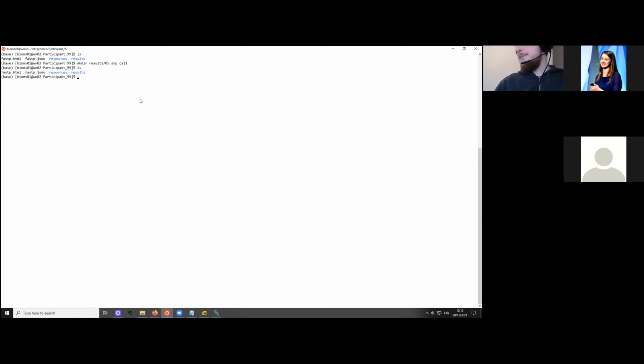Basically we want to find locations in our sample data which have different bases from the reference genome. In this specific case, we will only be looking for polymorphisms or base substitutions. The software that I'll be using is also capable of calling insertions and deletions, but today that's not what we are looking for.